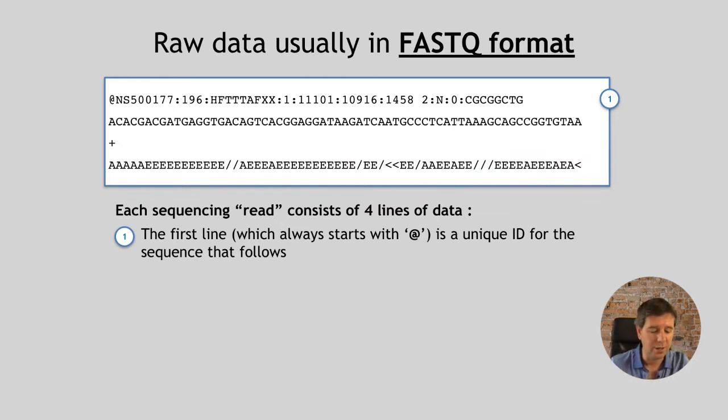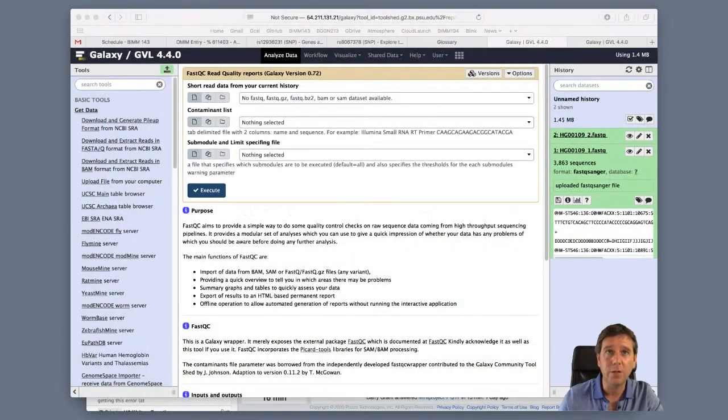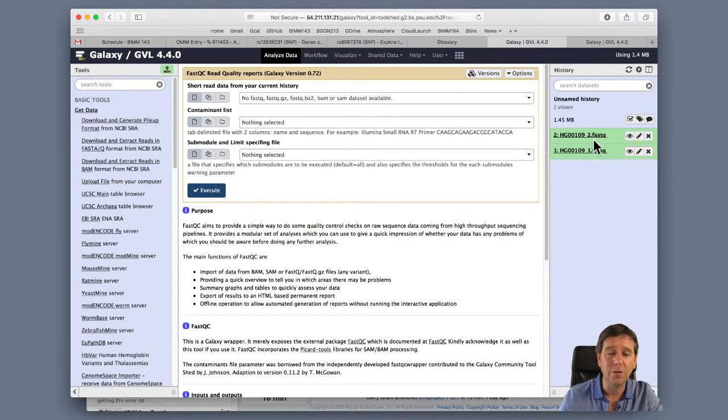We'll walk through the different lines in this, but let's check. In the background here, I see that my Galaxy server is alive and running, and my things have gone green. So why don't we just check on that for a second, just to make sure, and we'll come back to this slide in a moment. So here it is. Mine's gone green here. This was originally gray, if you remember. Then it went yellow when it was running, and then it's finally gone green. You should be able to see that.